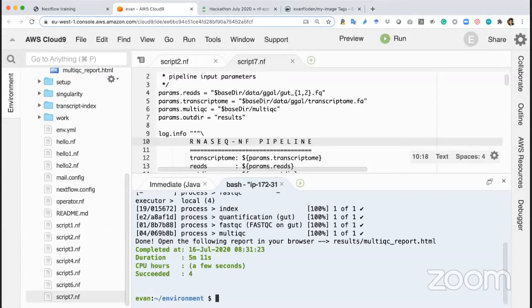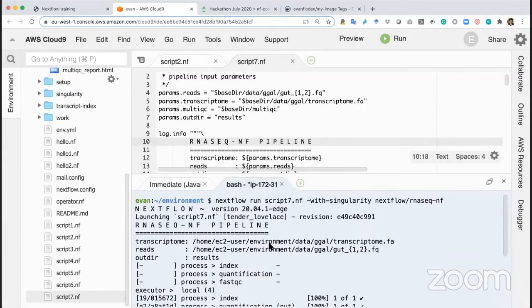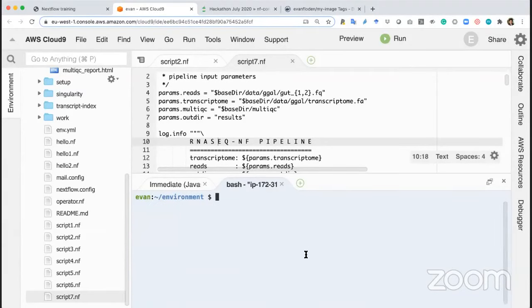Okay, thanks for bearing with me on that one before. So we saw that command now, the execution that we had before has just launched, it's finished, and this is running with the Singularity that we said before. So if I now look into this location inside the work singularity, we can see that a Singularity image has been created, and this was pulled from Docker Hub, remember.